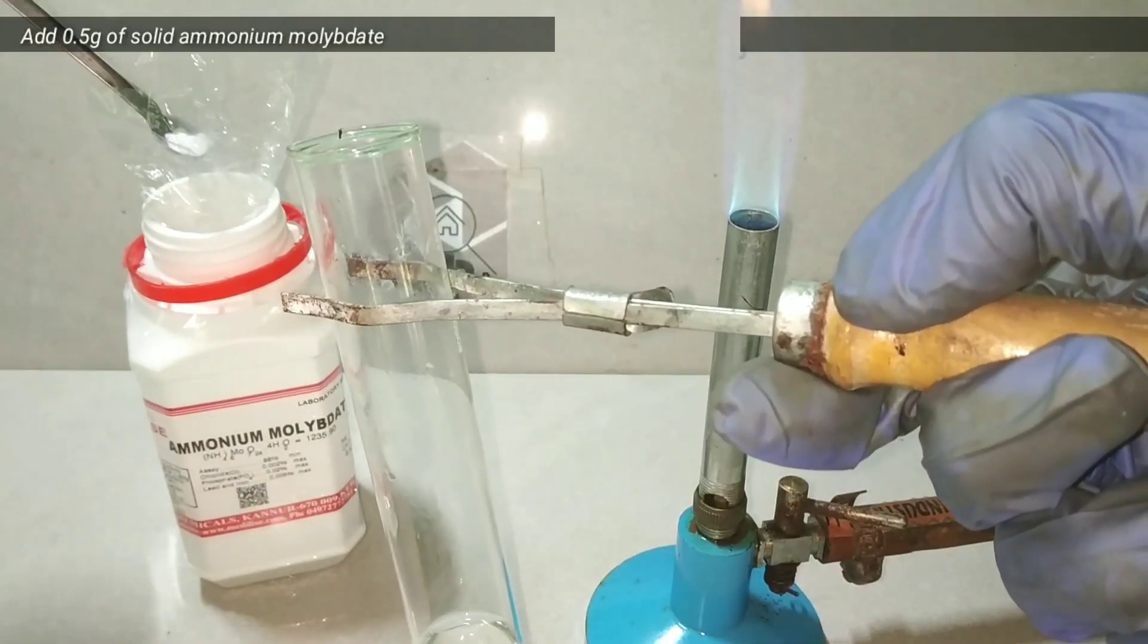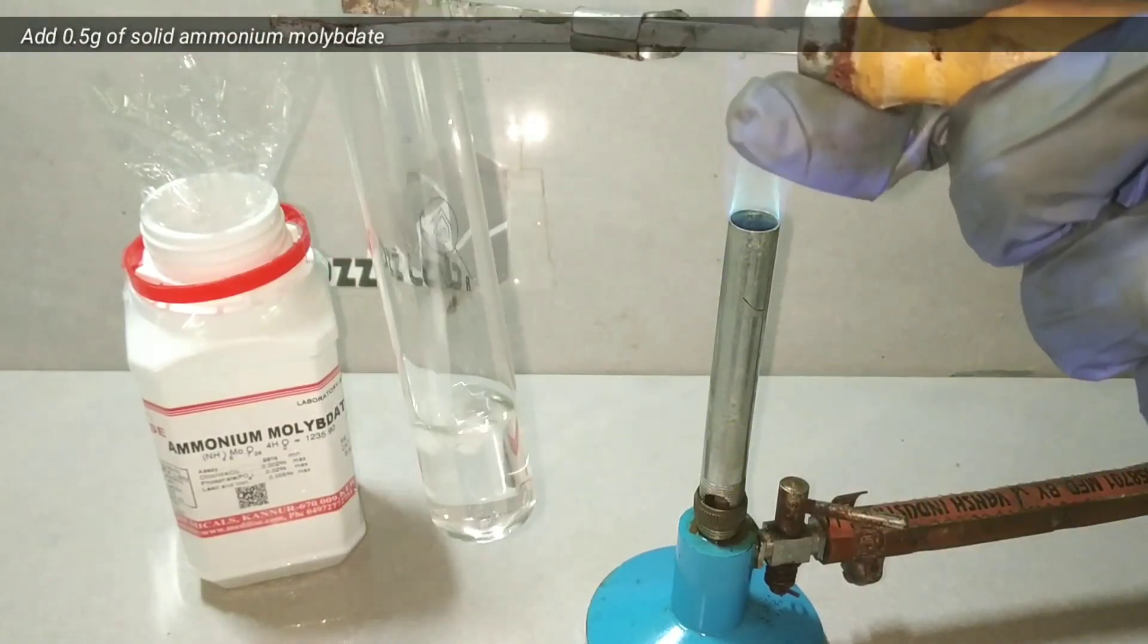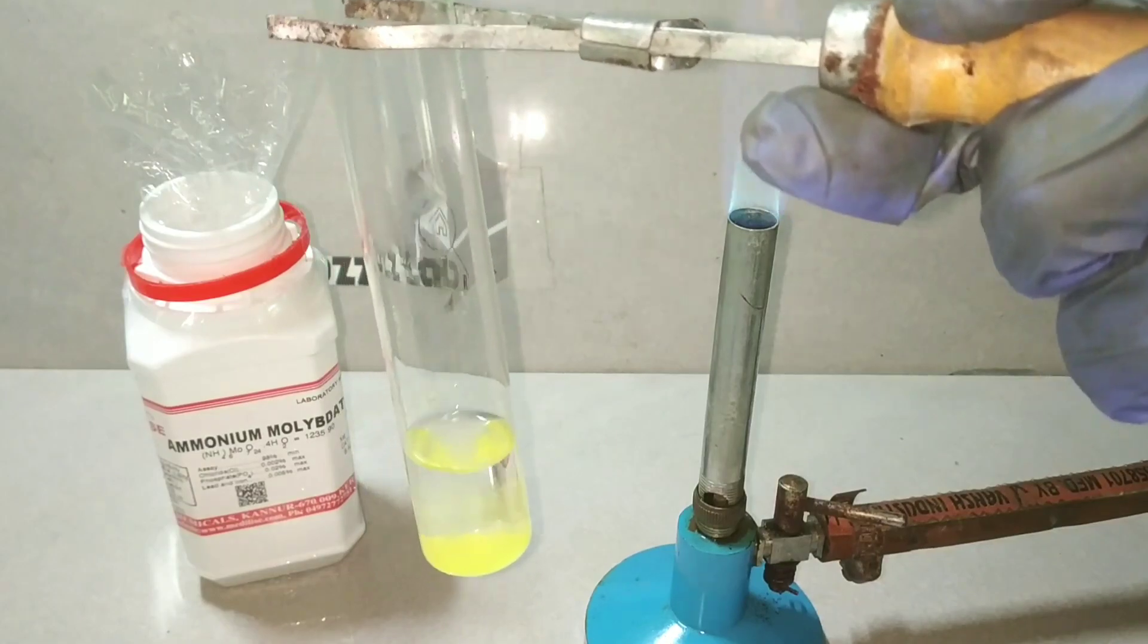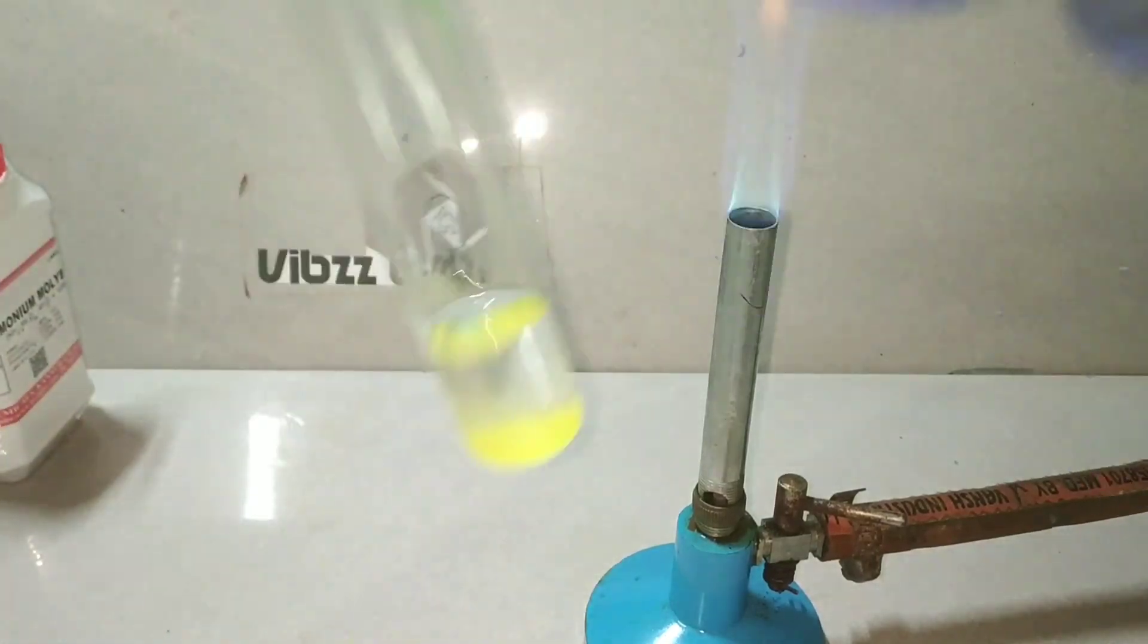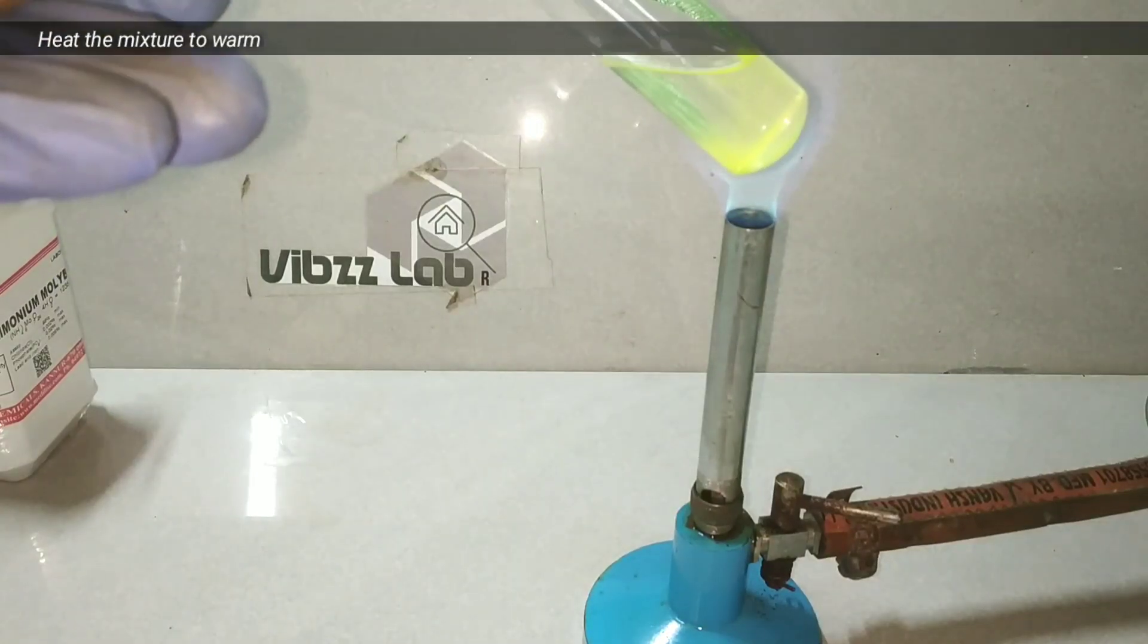Then we add about half a gram of solid ammonium molybdate reagent into it. You immediately see a yellow precipitate formed. Now we heat this test tube to boiling so that complete precipitation takes place.